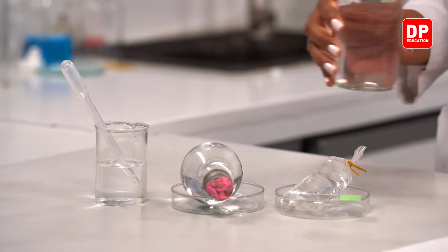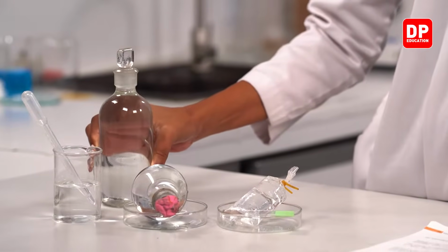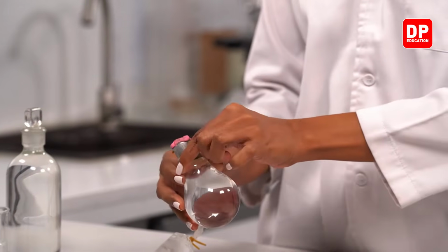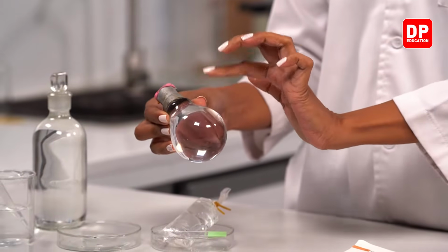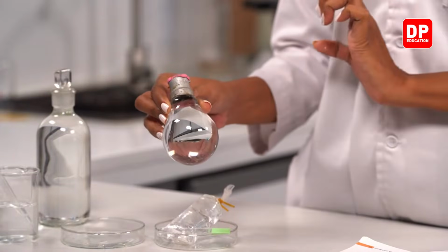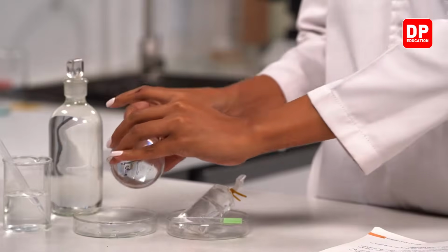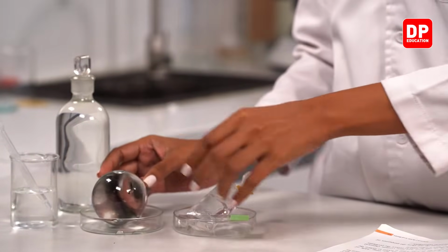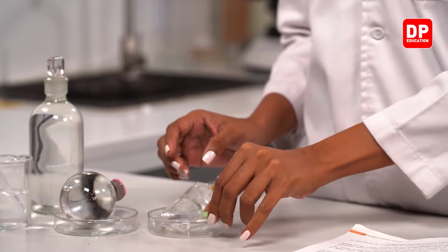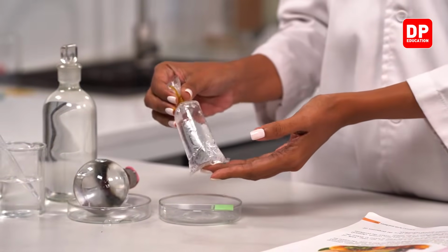You all can see this is a glass bottle filled with water, right? And you all can see this one. Now this is a filament bulb. You all can see very clearly, but the filament is removed, right? Filament is removed and this bulb is filled with water. And from here it is sealed so that the water will not leak, right? And you all can see this is a glass slide, right? And then this is a polythene bag filled with water.